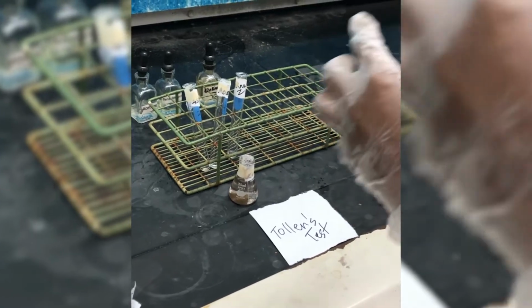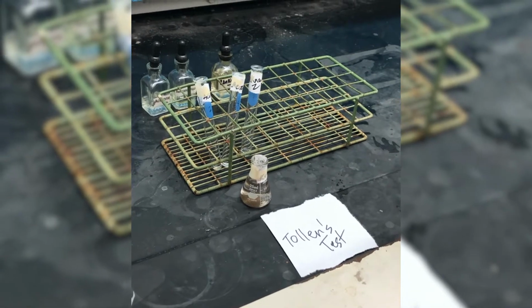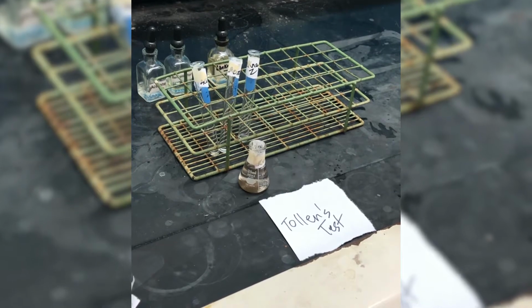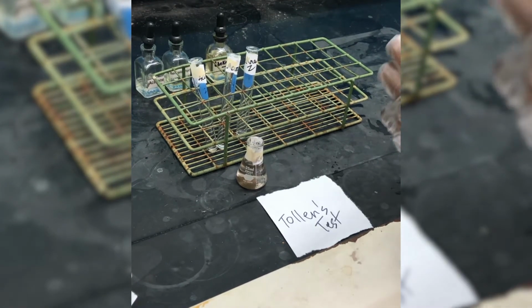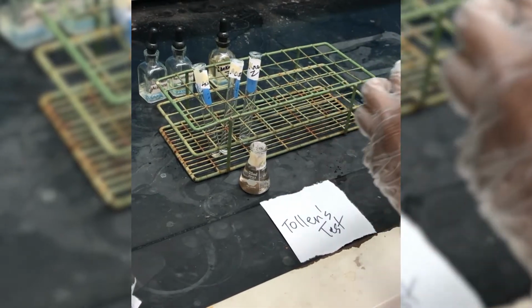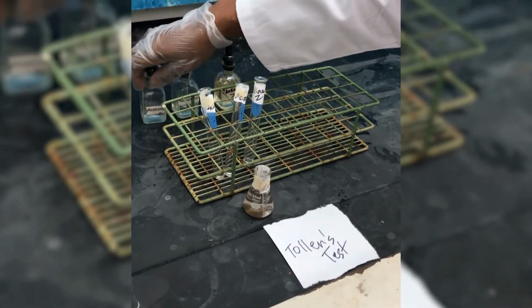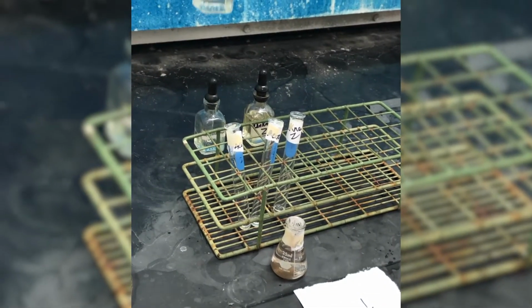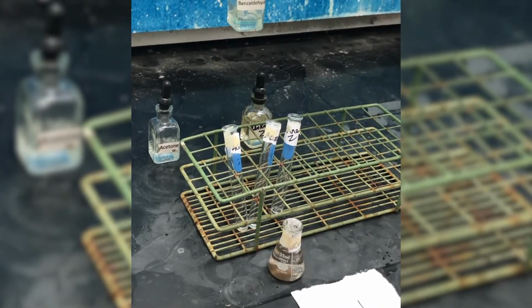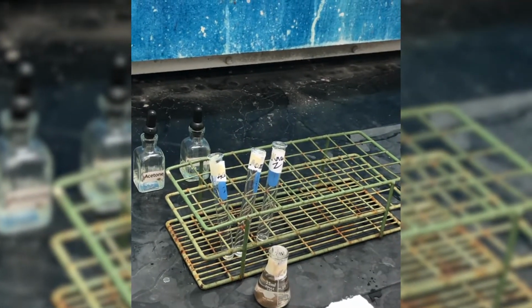Our second test with respect to functional group lab is what is called the Tollens Test. The Tollens Test is used to distinguish whether you have a ketone or an aldehyde. Our known ketone is acetone. Our known aldehyde is benzaldehyde. And then we have an unknown, labeled unknown Z.